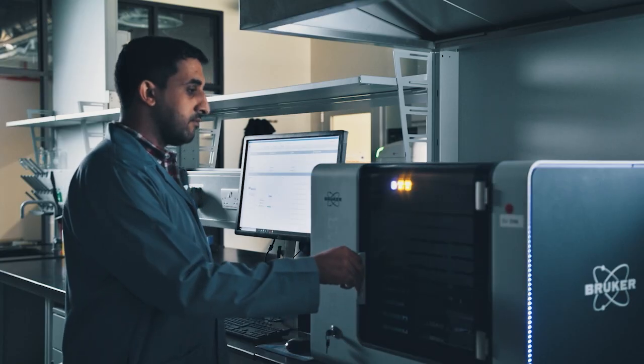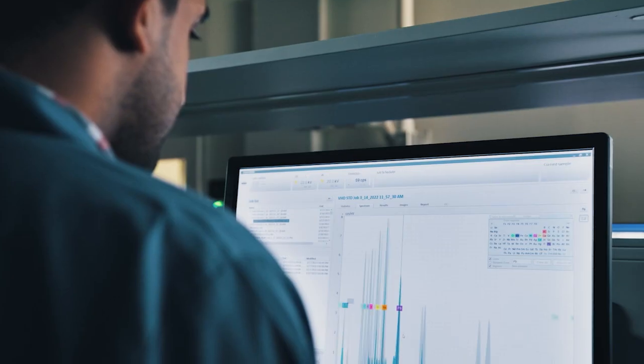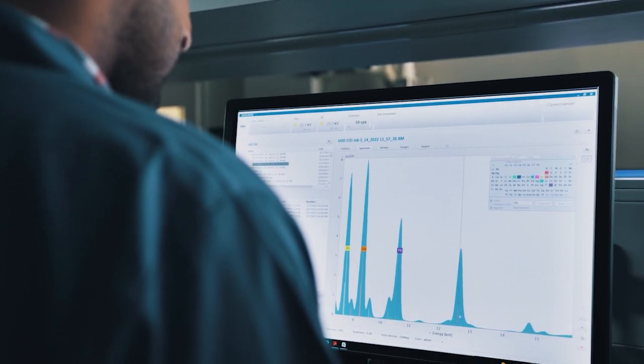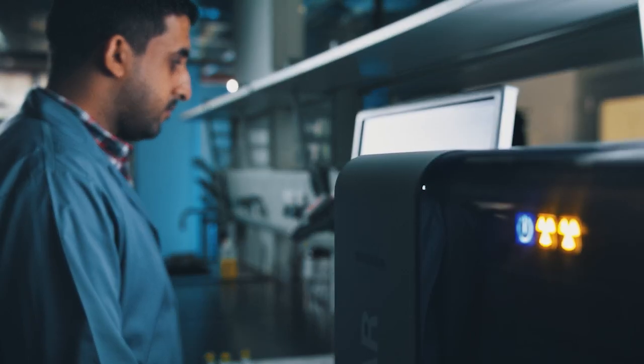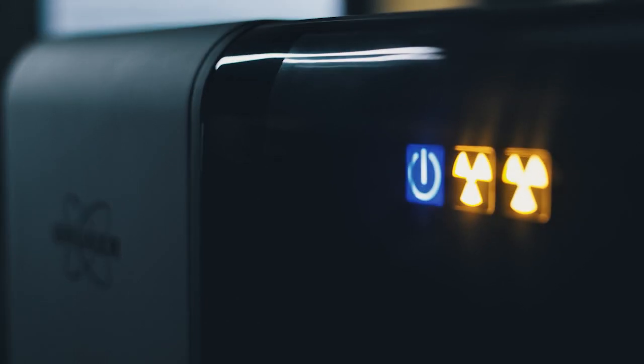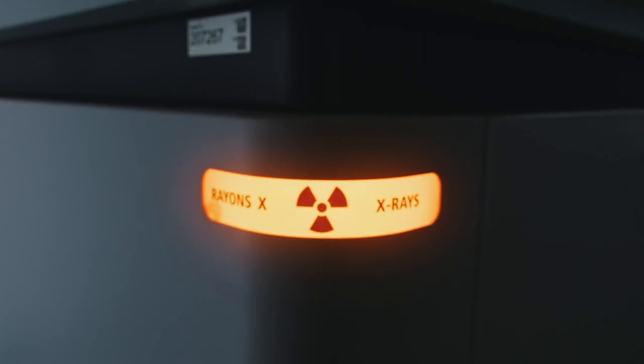Working with ionizing radiation and radioactive compounds requires special instructions by the instructor with the collaboration of the Radiation Safety Officer, RSO. Such work must be only performed at specially designated workplaces that only authorized personnel can enter. Most of the machines that use radiation have warning signs and warning lights alerting you of the danger. The equipment may only be used with permission and only after being briefed by the lab instructor. Fully protected equipment ensures that nobody comes into contact with radiation.